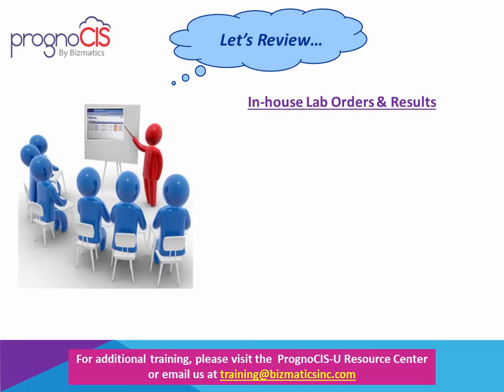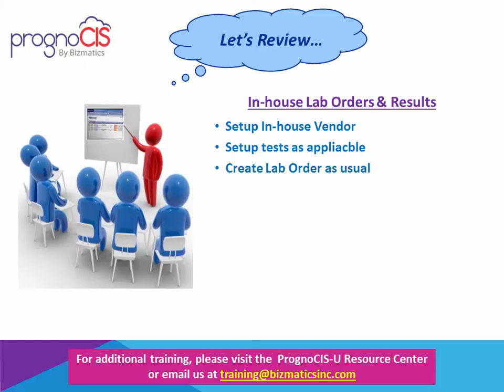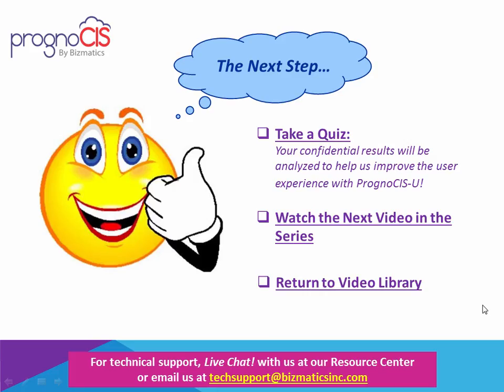So in review of in-house lab orders and results, the first step would be to set up your in-house vendor. Next, you want to set up any of the tests that are applicable to be ordered in-house. Create your lab order as usual. Route the patient and the specimen based upon your local process. And then the results can be entered immediately.